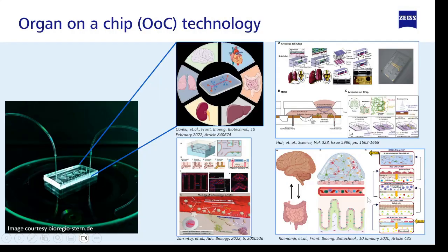Another application is organ-on-a-chip technology, which is widely used for people to understand human disease and treatment. Inside of the microfluidic chamber, it's usually a very complex environment containing many layers and many cells, and people definitely want to understand the flow speed and flow direction of certain drugs applied to a certain place of the cell.